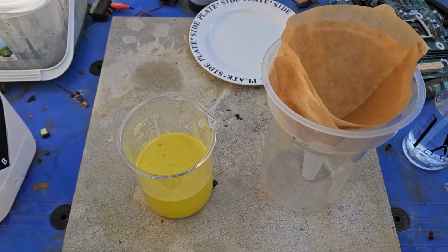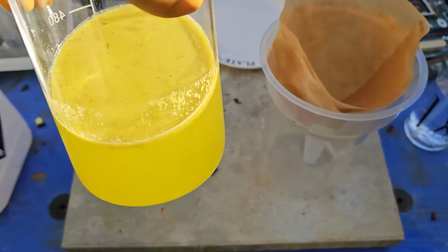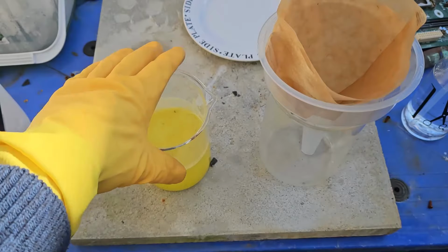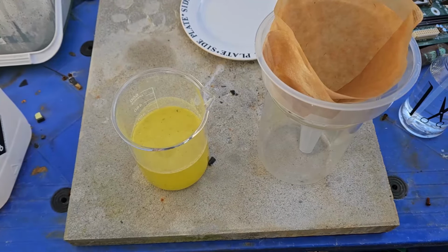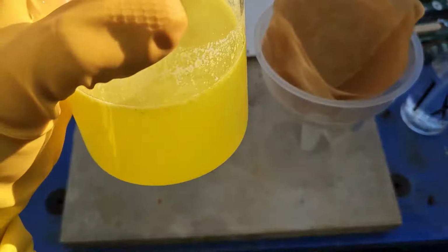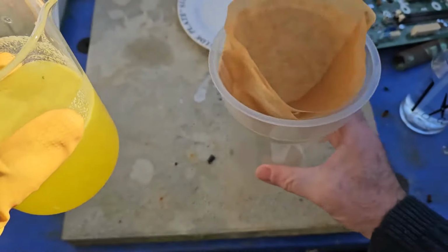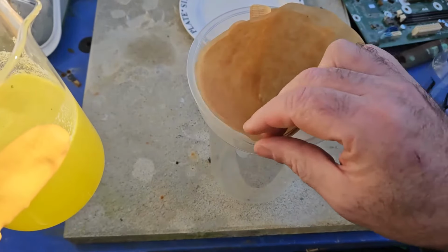Okay guys, so here we have our solution after I think everything has dissolved in it. So I've left it, I don't know, must be a week in there altogether. I said I was going to come back every couple of days and check it, but I just left it because the weather was bad, so I let it dissolve away. So everything seems to have dissolved in it. It seems to be gone, but it's very cloudy, so we're going to filter it and see what it looks like.